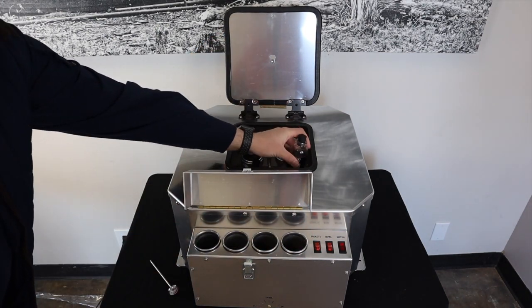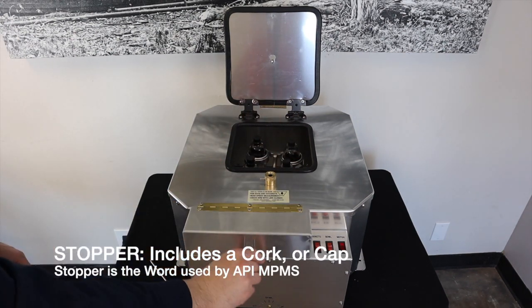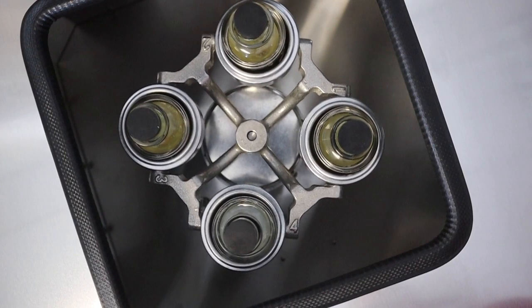Make sure you have placed a cork in each of your tubes to prevent leaking and to ensure proper function of the centrifuge. Always close all lids before starting the centrifuge spin cycle.